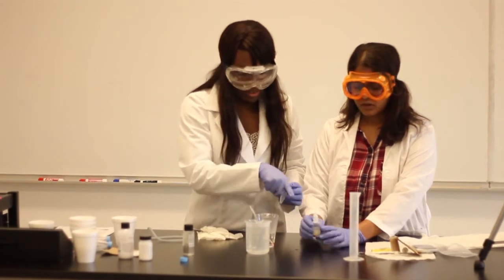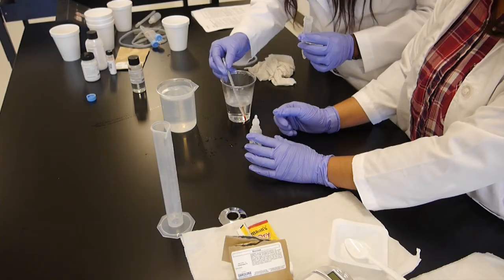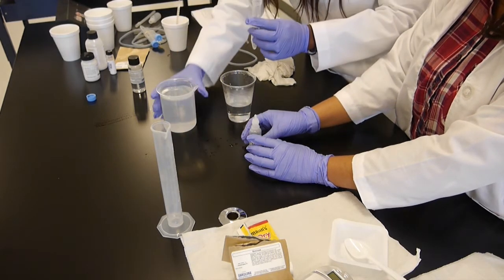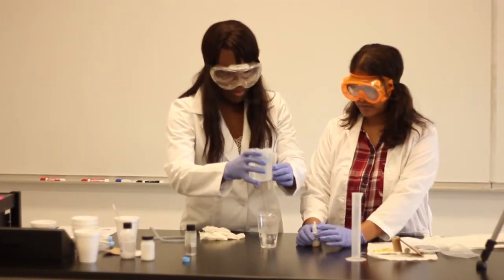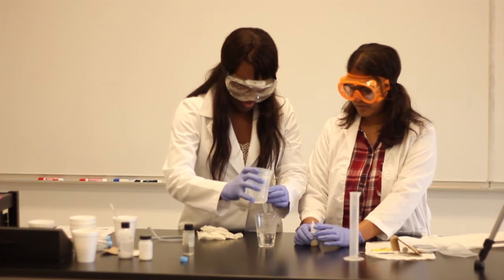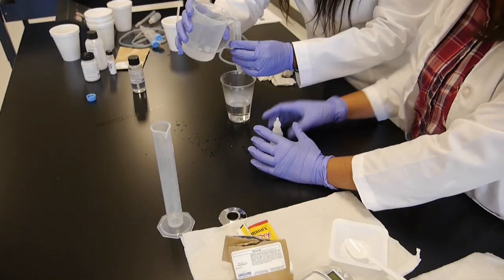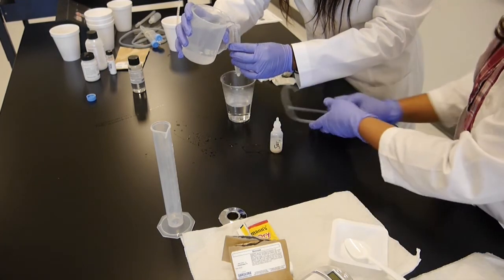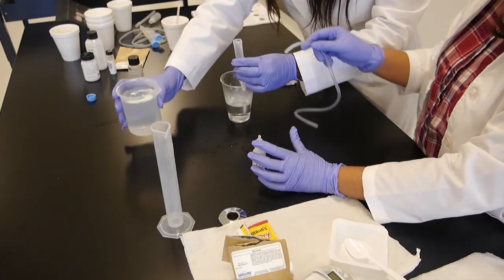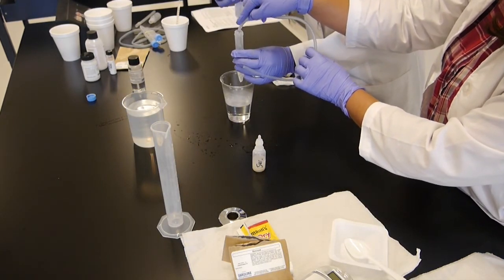This is where we're going to be placing the yeast solution in the bottle in that small one. So don't fill this one out. It's also around 35, so we should be good to go. Now I'm going to take this and pour some of the water in here. Oh, I'm going to pour it right here. And you want to try to fill this up as much as possible. And then we will insert the hose. Oh, insert the hose, yeah, real deep. That's what I did last time.